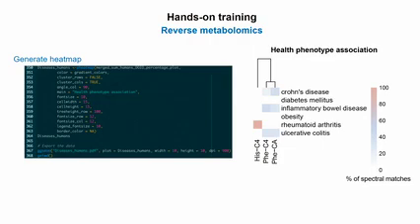Everything is modifiable, right? You can apply a 0.9 cosine score if you want, and then have over 10 matched peaks. But then you need to know how your molecule fragments. For bile acid, it will make sense. But for N-acyl lipids, if you have histamine C2, for example, then maybe having 10 matched peaks is unreasonable, and you won't get matches. You need a little bit of background on how you do things and how to be cautious with it. Okay, thank you.